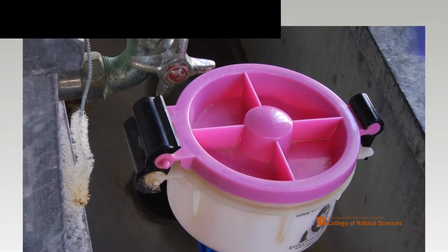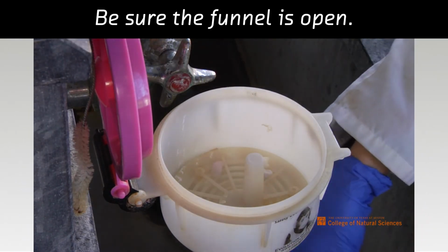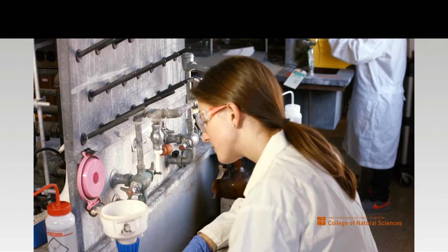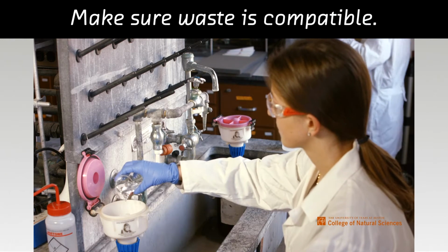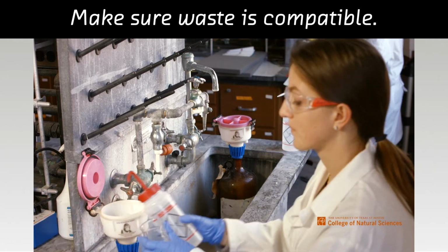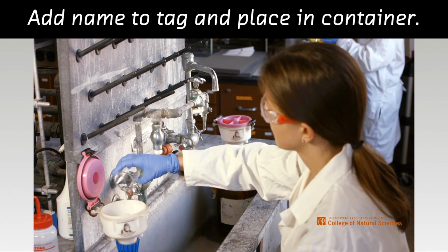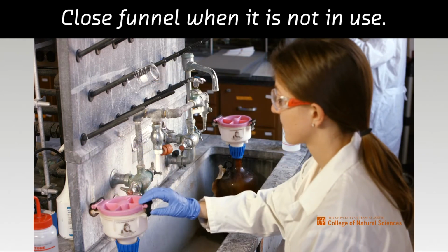If using a safety funnel to pour waste into a container, first, be sure that the funnel is open. Next, check the waste tag to make sure it lists the compound you intend to pour into it. If it does not have your compound listed, you should make sure that you are introducing waste that is compatible with that already in the container. If your waste is compatible, you may add its name to the tag and place the compound into the container. When you are not actively using a waste container, the funnel must be closed.